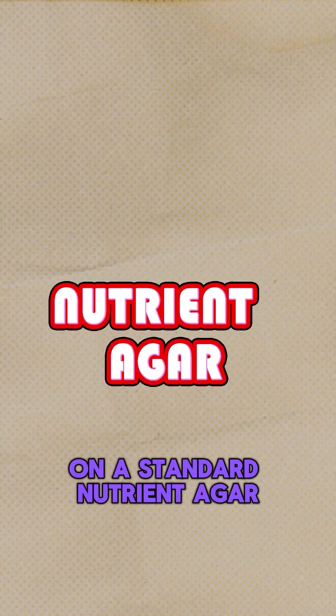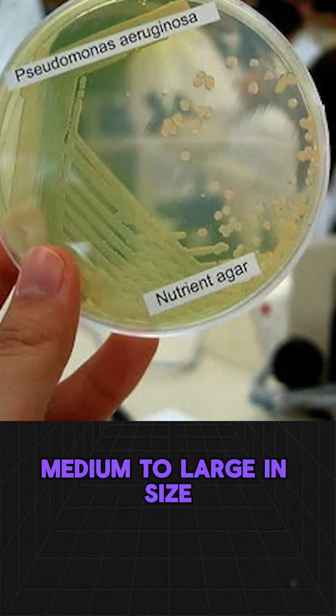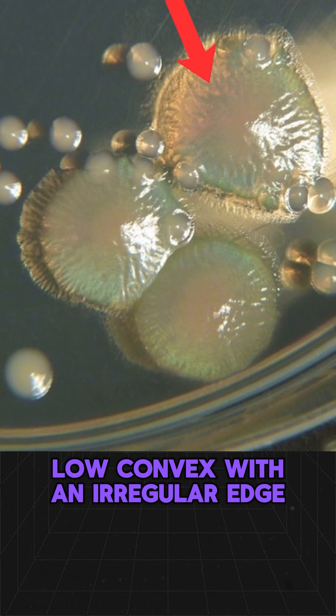On a standard nutrient agar, Pseudomonas aeruginosa colonies appear smooth, medium to large in size, low convex, with an irregular edge.